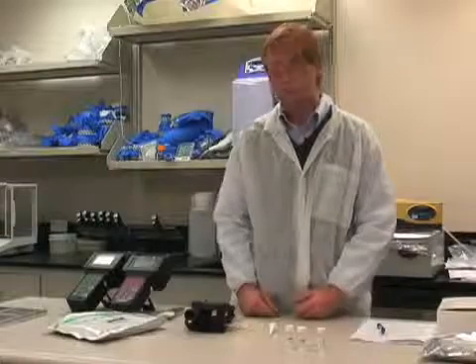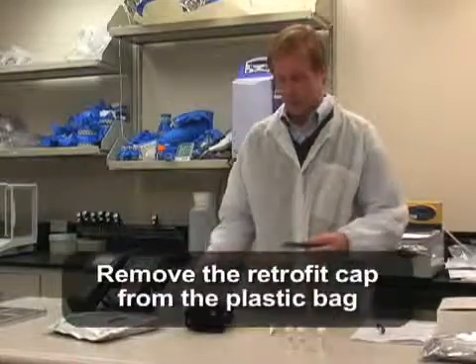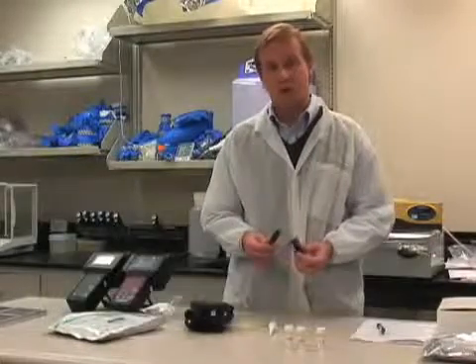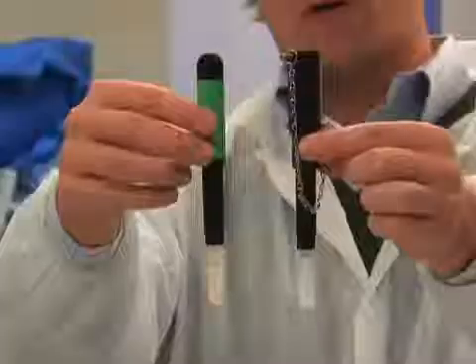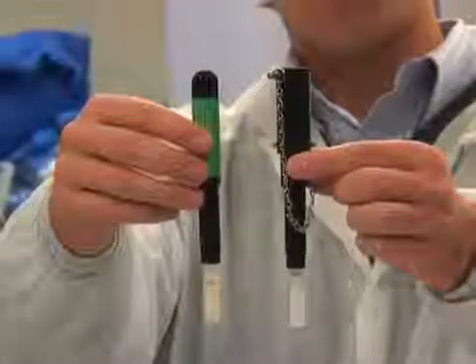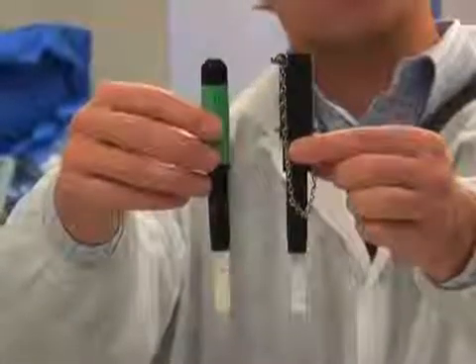Now that you've finished testing with the Charm pocket swabs, we're now going to start testing with the Snapshot products. First thing you want to do is get the retrofit cap. This cap allows the Snapshot product to work in the Charm machine. What it does is it replicates the bottom part of the Charm machine so the test works exactly the same. When the Snapshot product's inserted into the retrofit cap, you can see that it replicates the Charm device perfectly.